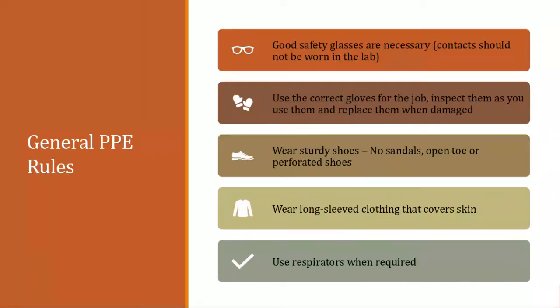So, general PPE rules. This is going to be happening in our labs. When we do meet, obviously everybody's going to have safety glasses, safety goggles. There's a difference between the two of them, and it's going to depend on what you work with. Using the correct gloves for the job, and replacing them when they become damaged, or if you notice a hole in them or anything along those lines. Wearing actual sturdy shoes. Obviously no sandals. It's winter time right now. I don't think anybody's going to be showing up in sandals, but open toes or any type of perforated shoe will not be allowed in the laboratory.